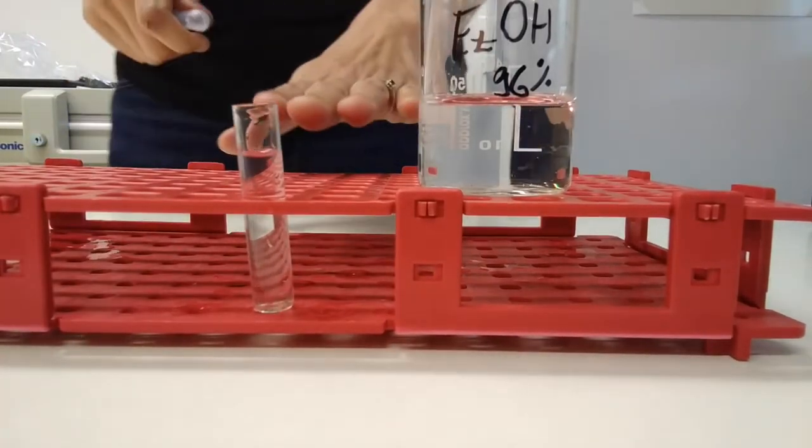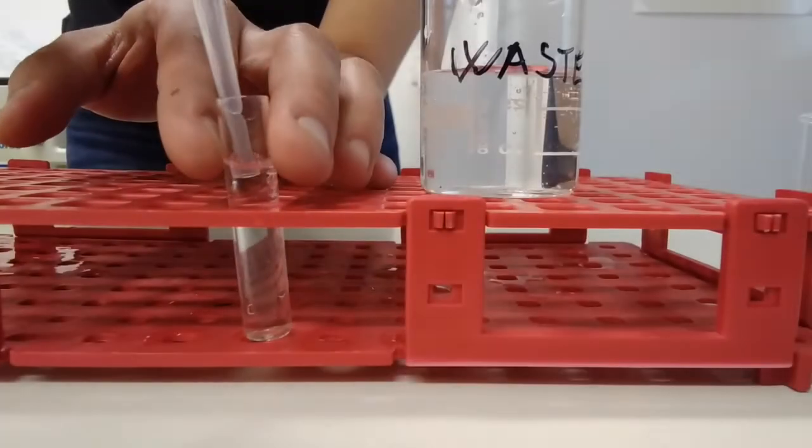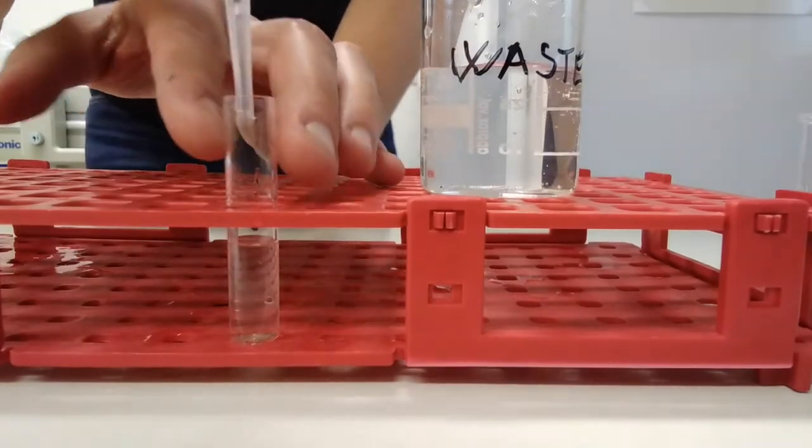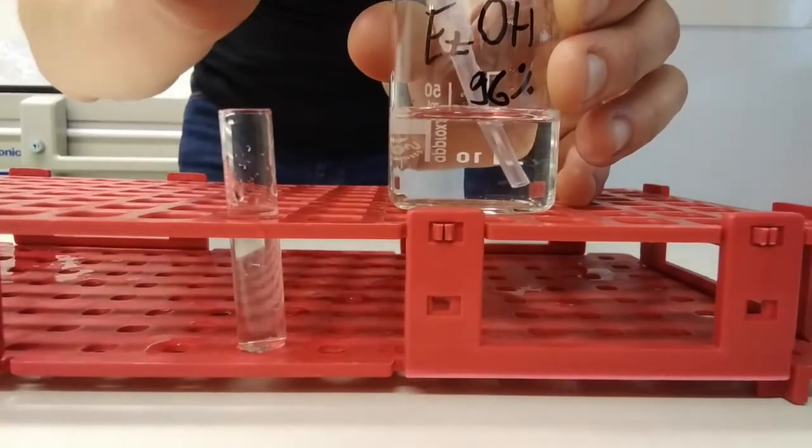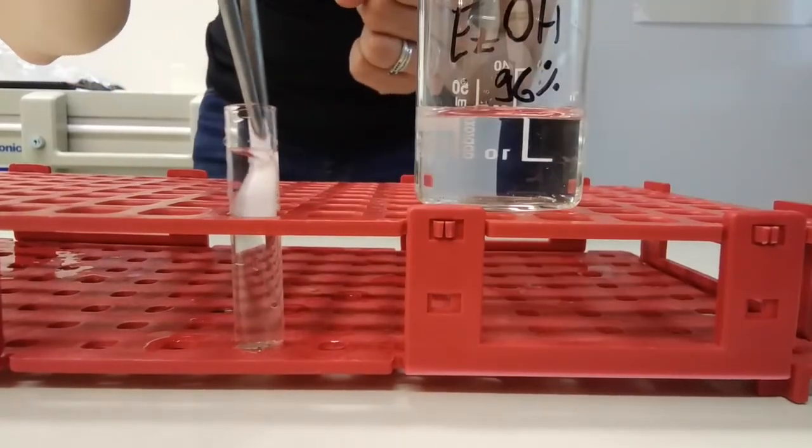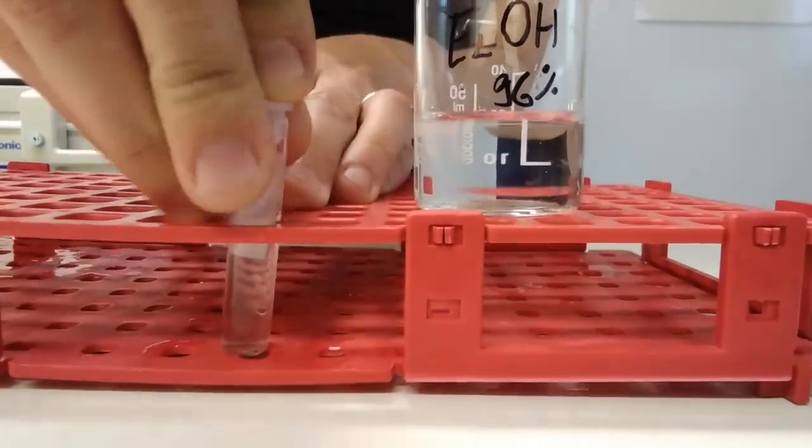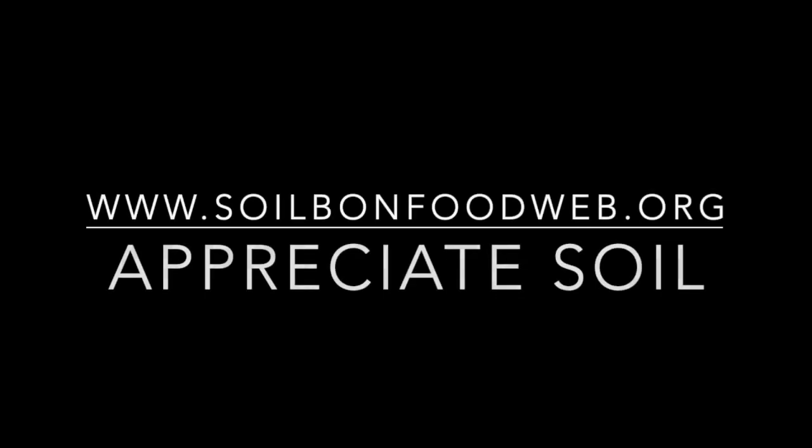We let the animals sediment for 15 minutes. Now we repeat the procedure to increase the ethanol concentration to about 90%. Put the label in the vial, close and store it in the freezer. If you have any questions, contact us.